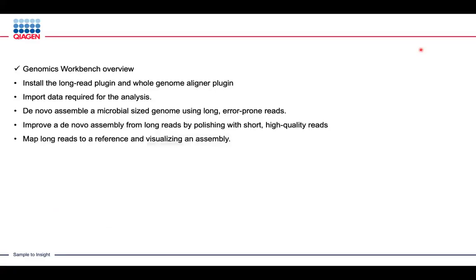So that's my quick overview of the Genomics Workbench. I just thought it would be important to give everyone a quick lay of the land and an understanding of the other research areas that we can facilitate within the workbench. Again, I mentioned that these are plugins, and so what we'll talk about is how to install plugins into the Genomics Workbench to add that long read plugin and our whole genome alignment functionality.